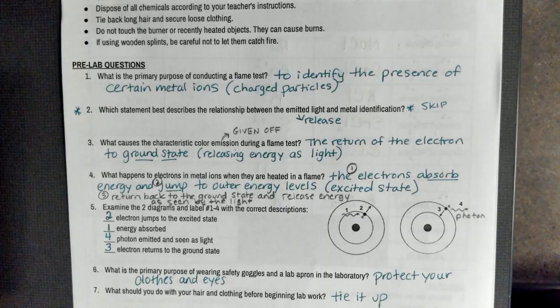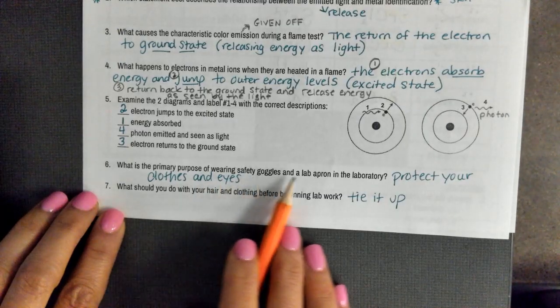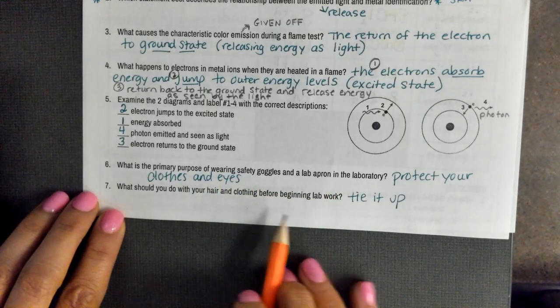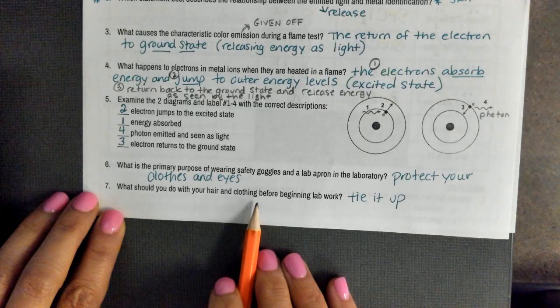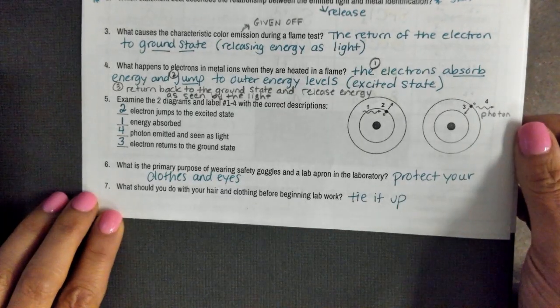Okay, and then questions 6 and 7, those are just going over lab safety. So what's the primary purpose of wearing your safety goggles and apron? It's to protect your clothes and eyes. And then what should you do with your hair and any loose clothing? You want to make sure that it's tied up so you have nothing dangling.